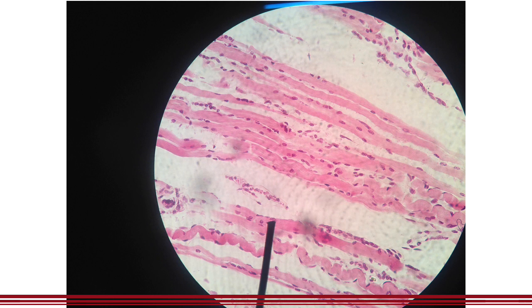Now please take note that you have a lot of nuclei. They are multinucleated, and the nuclei are located in the periphery of the cells.